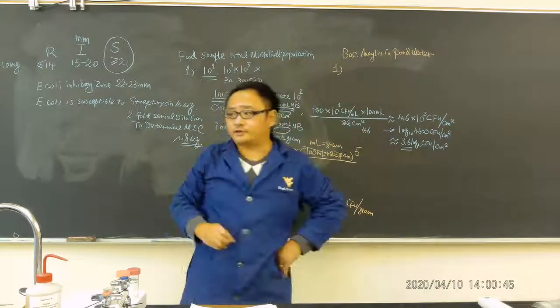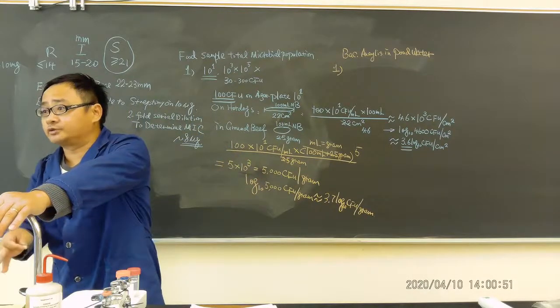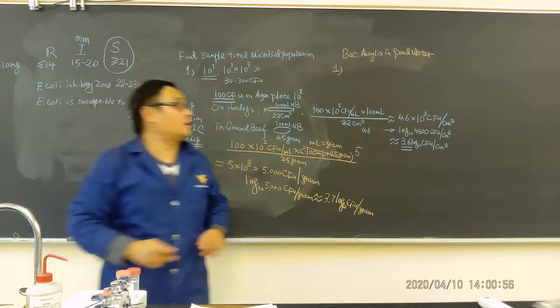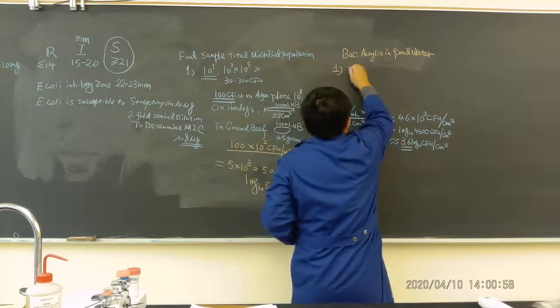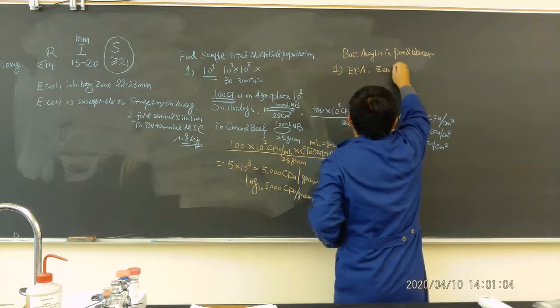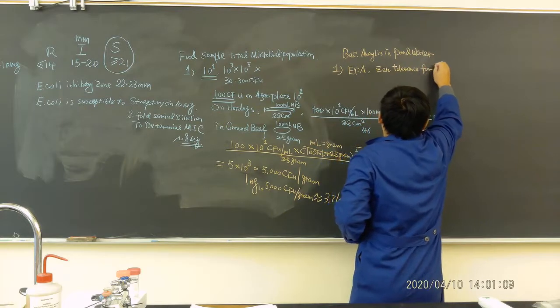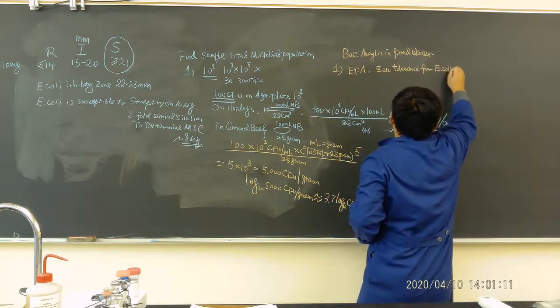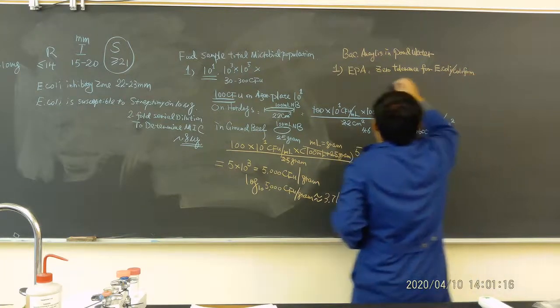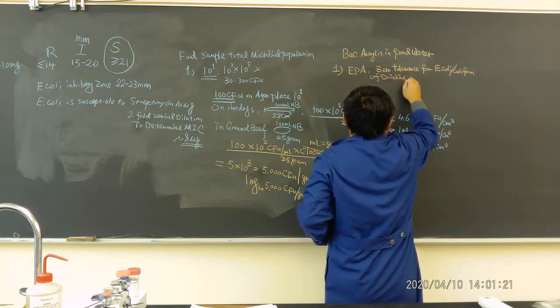Okay, so we want to discuss several things. First of all, in the United States, if you turn on any of these tap water, ideally you can drink it, because the EPA has a regulation of zero tolerance for E. coli and coliform in drinking water in the US.